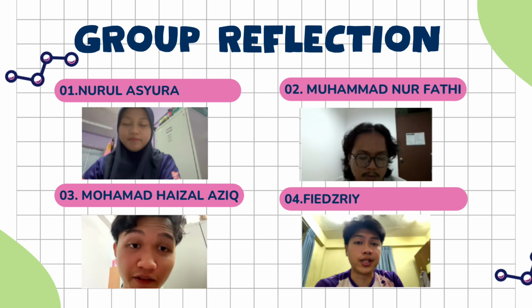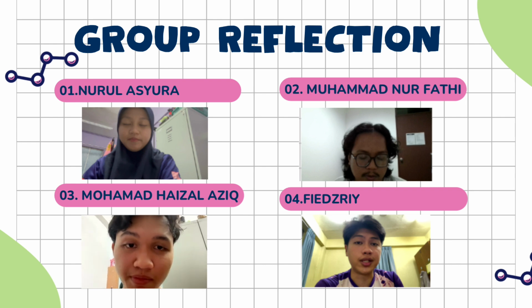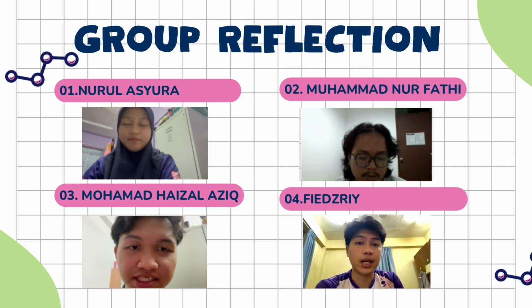Some of the challenges faced during this experiment were the workspace constraint, where 5 of us had to work on a small bench area, and dividing the labor, because some of us had to do the experiment and some of us had to record it. This made it hard to ensure everyone had hands-on experience using every machine included in the experiment. For suggestions on improvements, I think all samples can be prepared in 3 replicates, and then we need to ensure that the temperature is stable, such as all the tubes being cooled to room temperature before reading.